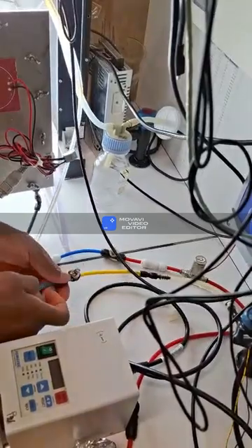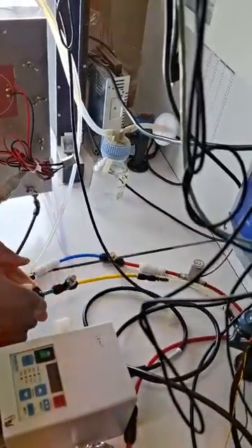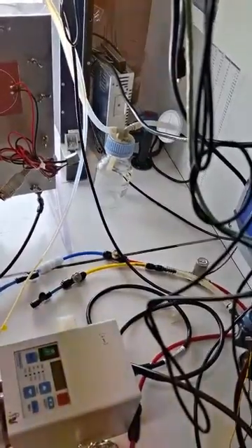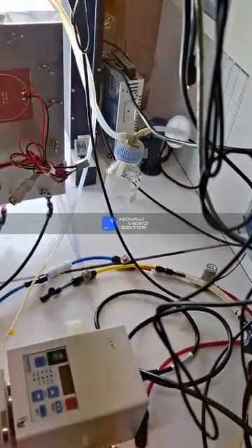But when we put the air, it automatically produces some bubbles. Yeah, you will see in a few minutes. If the system makes pressure, air is coming.